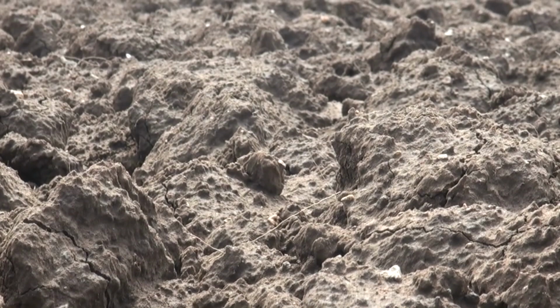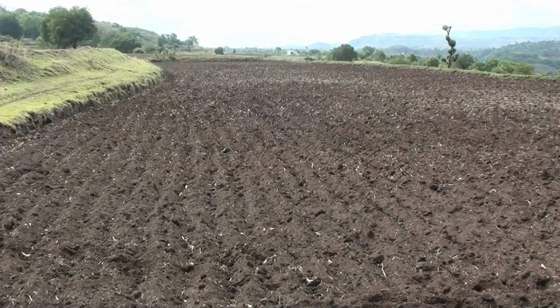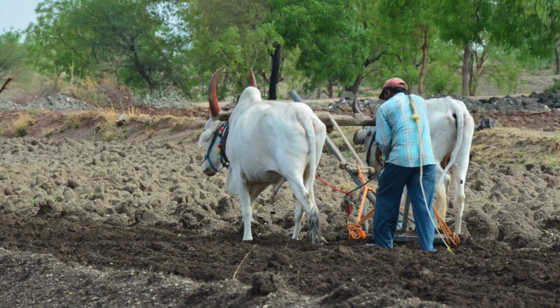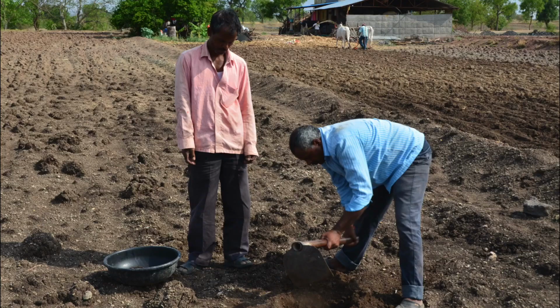Let us therefore learn how to take soil from the field for testing. Proper sampling of soil for laboratory testing is the key to soil health assessment program. While taking samples for laboratory testing, following are few precautionary measures that need to be taken to avoid erroneous results.